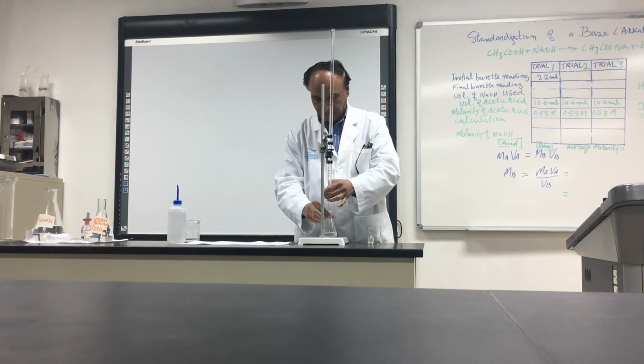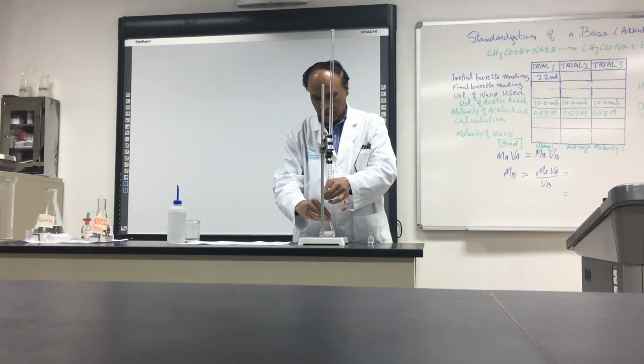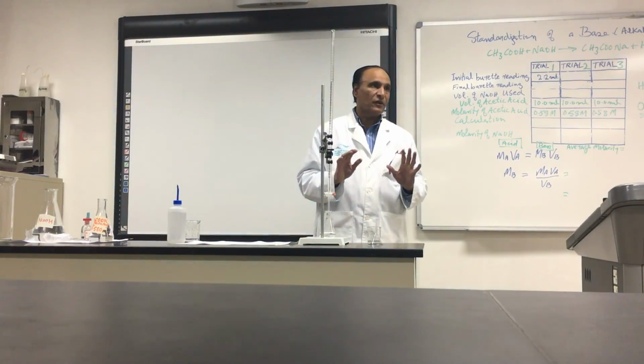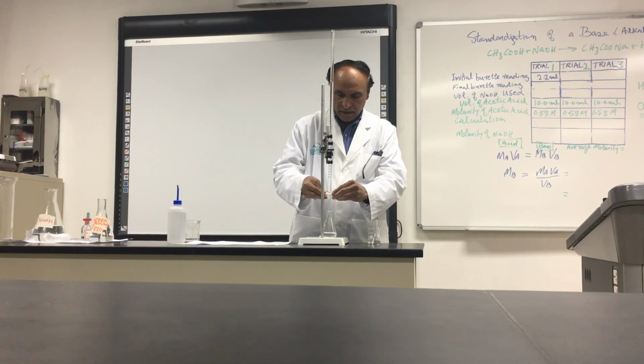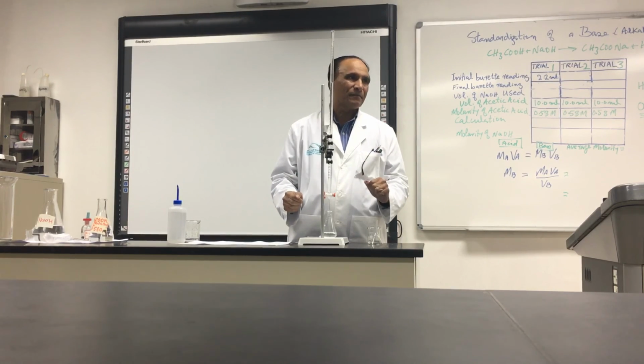So you see that I am adding a drop at a time, and as I'm telling you again, if it is difficult for you, put the flask down and put a drop at a time. Control it and put a drop very slowly, one drop at a time.